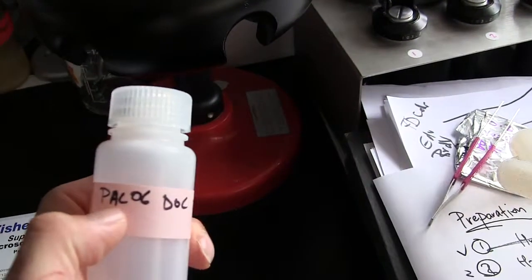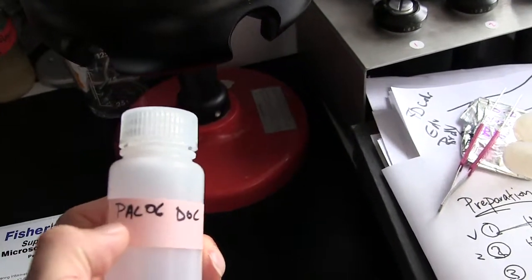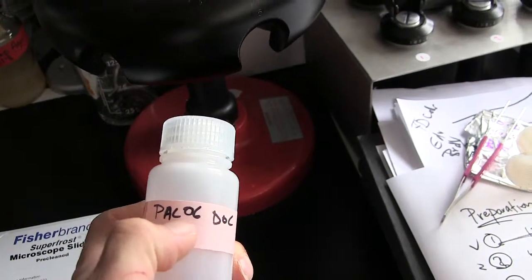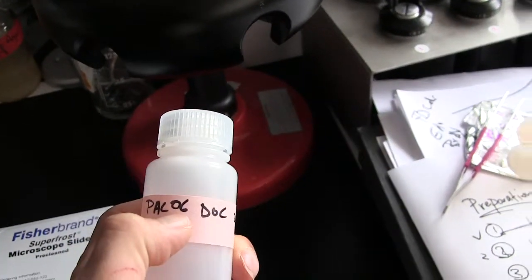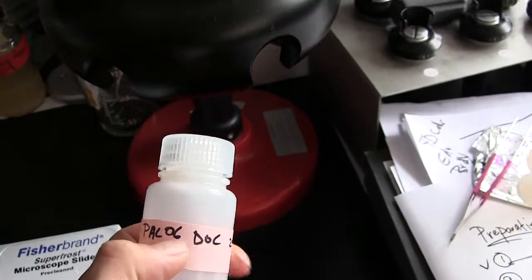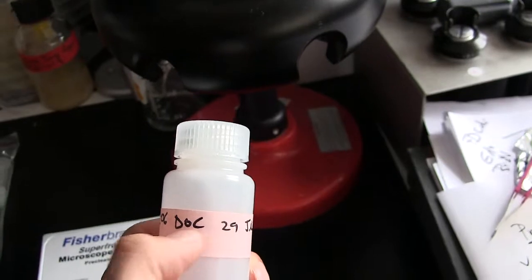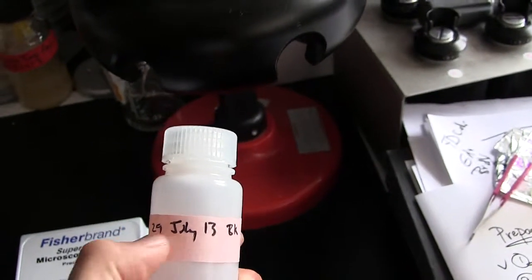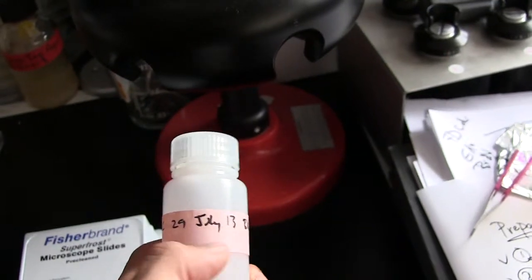Okay, so here we have the site, which is Palo 6. With NOAA cruises at least, we have a 3-letter island code followed by a 2 or 3 digit site number. So Palo 6 is Palmyra, site 6. DOC, this is a dissolved organic carbon sample. The date, the full date please, 29th of July 2013.